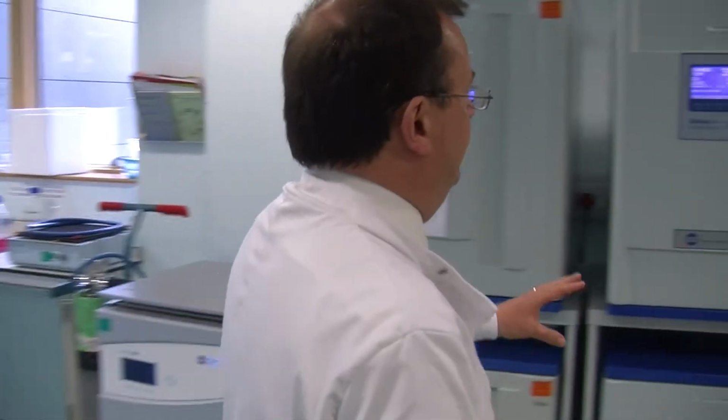The other thing with cultured cells is over here, we need to keep them in an incubator. Cells are happiest at 37 degrees centigrade, and we use a 5% CO2 atmosphere to provide a buffering for their environment. And that essentially is how we look after cultured living cells. And these are used in many applications, for example, the evaluation of biocompatibility, or in cell therapy itself, how we actually start to look at using cells as vehicles for repairing diseased or damaged human tissues.